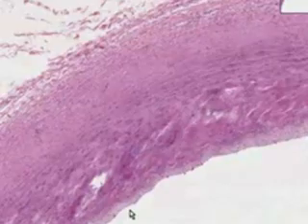Here is a typical artery. An artery is a large, thick-walled, muscular blood vessel distributing blood to an area rather than from it. An artery, no matter what size it is, will always have a fairly thick, rigid wall. It will have a little squiggly, like we saw in the slide of the aorta. It will have kind of a squiggly internal elastic lamina, like we can see here.